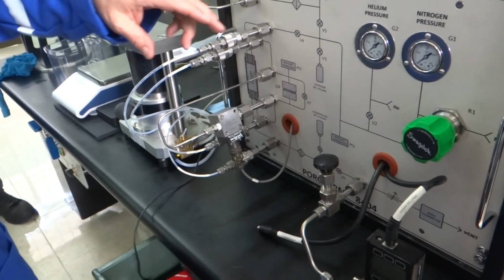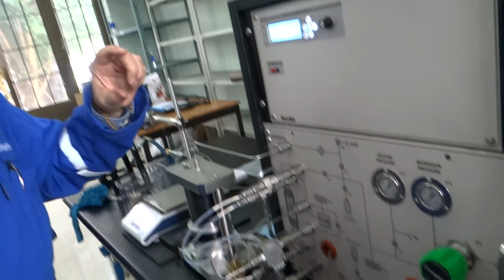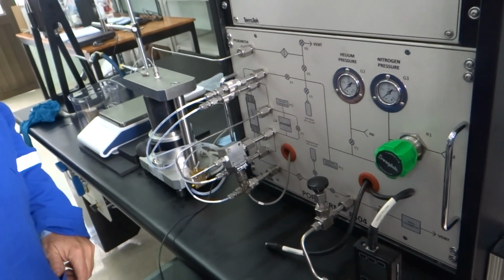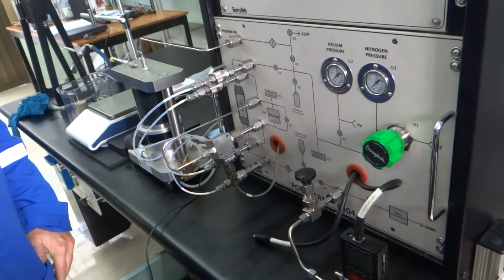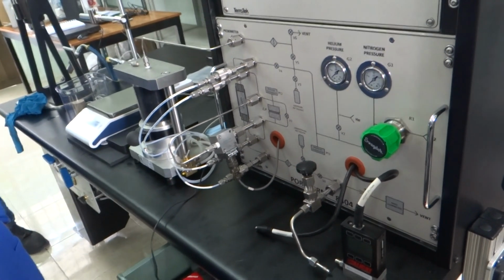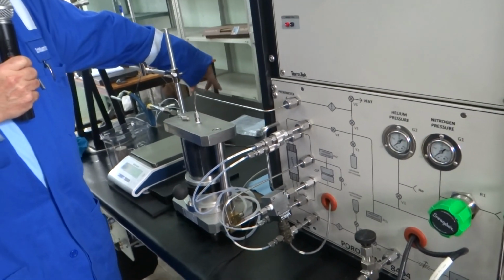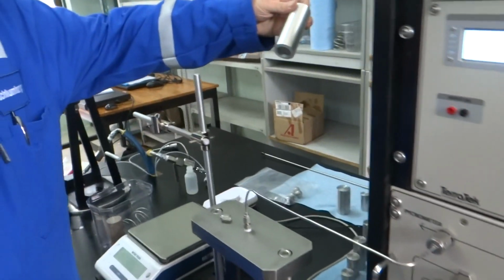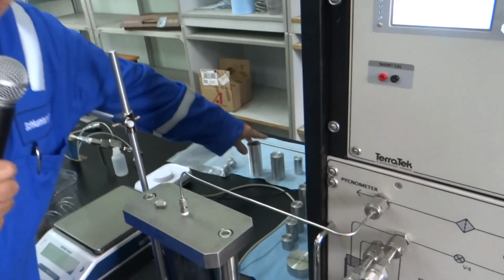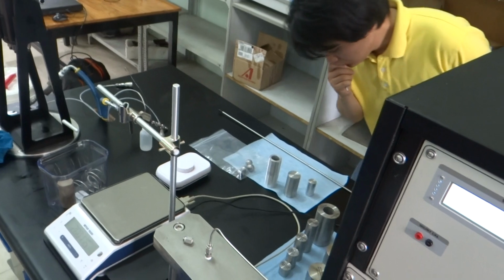You use those when you're doing a transient permeability because it's taking the gas from the upstream volume and expanding it into the downstream volume. To calculate those volumes, you use the spheres and this annular volume. The manual shows you how you go through those steps to calculate the upstream and the downstream volumes.